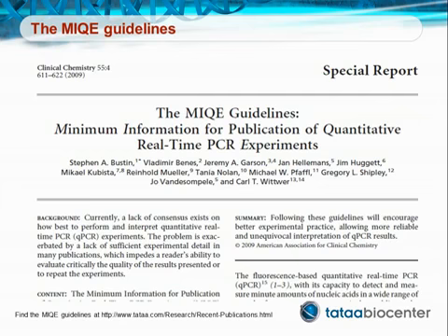If you want to read more about the MIQE guidelines, you can do so in this publication and its later revisions.